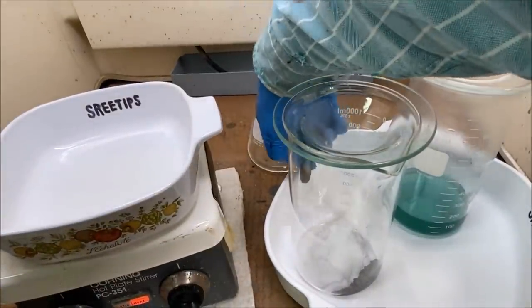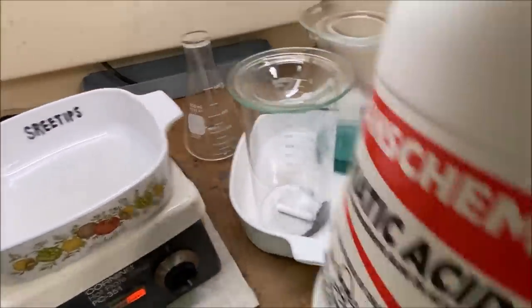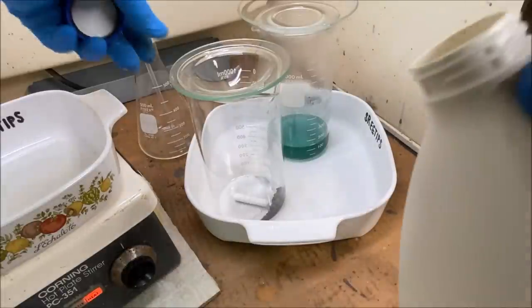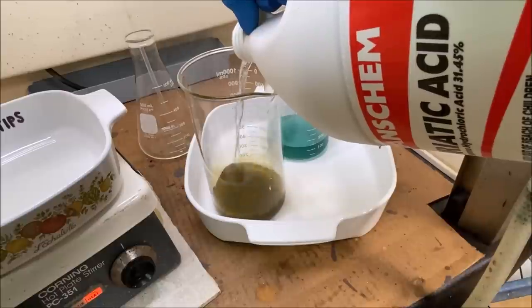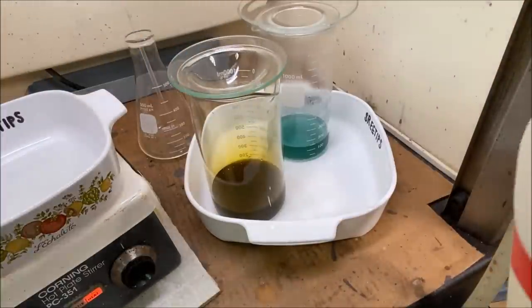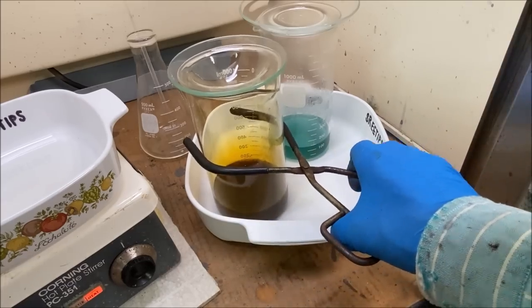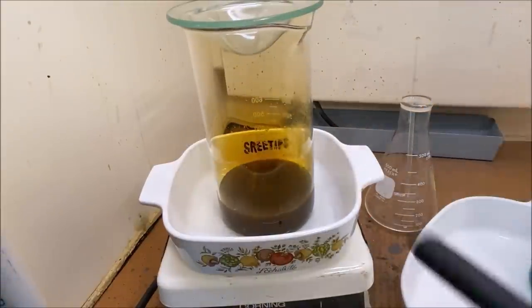Stir bar back down in there. I think what we'll do is add a little bit of hydrochloric acid, let's put about 100 milliliters in here, maybe 150. Get an immediate reaction because there's residual nitric acid in there. Let's go ahead and put this up on the heat now. Start stirring.